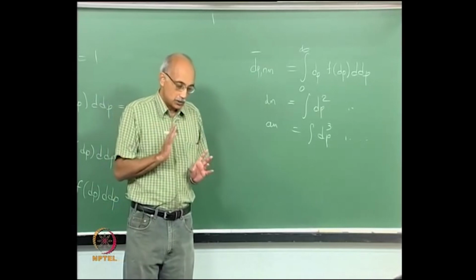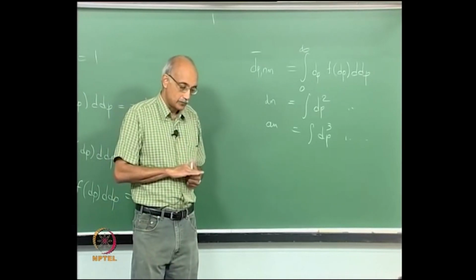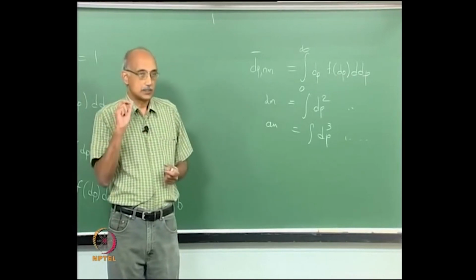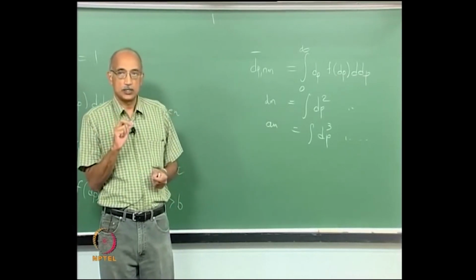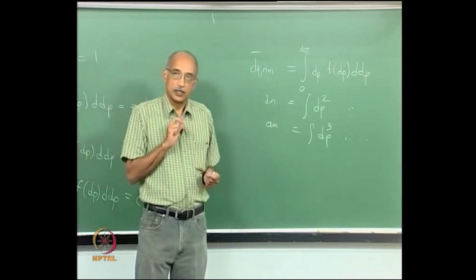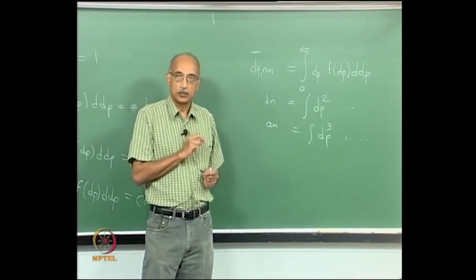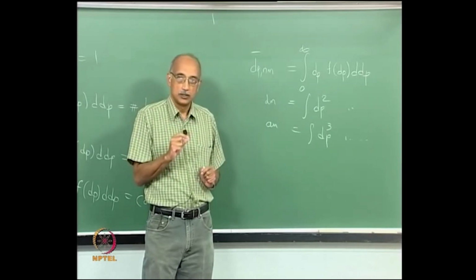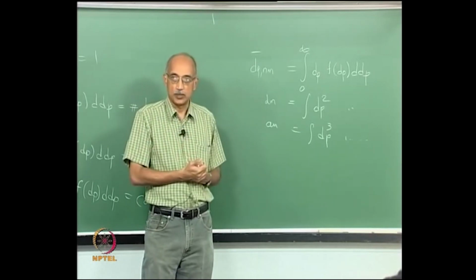So the key point in all this is that particle size measurement in its essence is a single particle measurement, particularly if you are using a technique like light scattering. But ultimately the use of particle counters and particle size analyzers is not for looking at a single particle, but rather an entire population of particles.